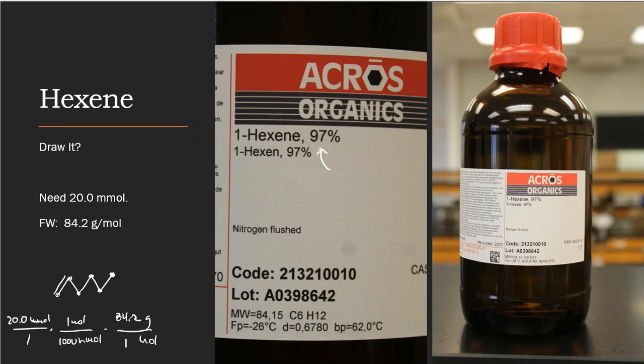All right, so those are the majority of my ingredients that I need in the first part of the experiment. 1-hexene, because that's the double bond that we want to break. When we break the double bond, it's going to be our mission to add the OH group on the opposite carbon. So an anti-Markovnikov reaction is going to happen. Well, in order to do that, I need sodium borohydride and THF as part of my ingredient list. And that's why we've decided to weigh those out as well.